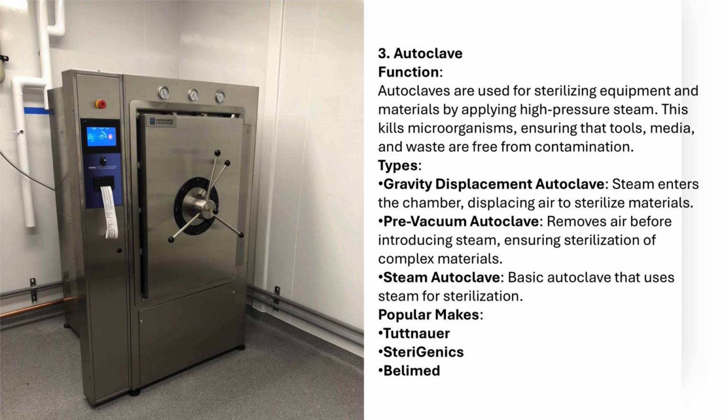Let's dive into one of the most important tools for ensuring a sterile environment in the lab, the autoclave. Autoclaves use high-pressure steam to sterilize equipment and materials. By killing harmful microorganisms, they ensure that everything from tools and growth media to waste materials are free of contamination. Autoclaves are a must-have for any microbiology lab to maintain a clean and safe workspace.